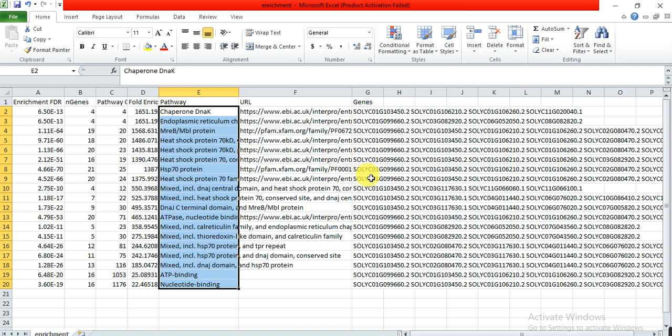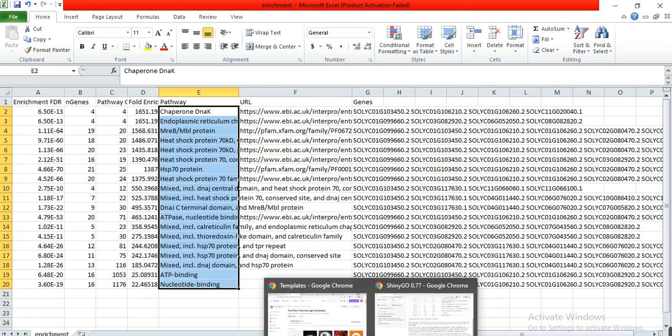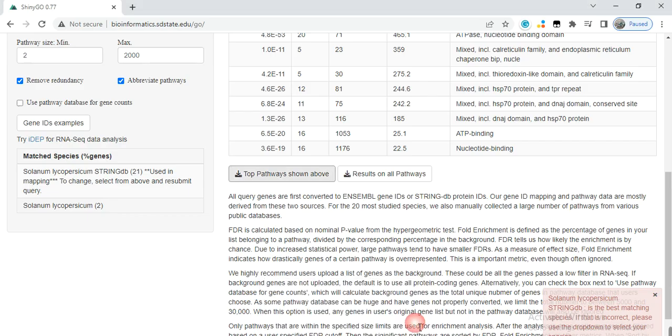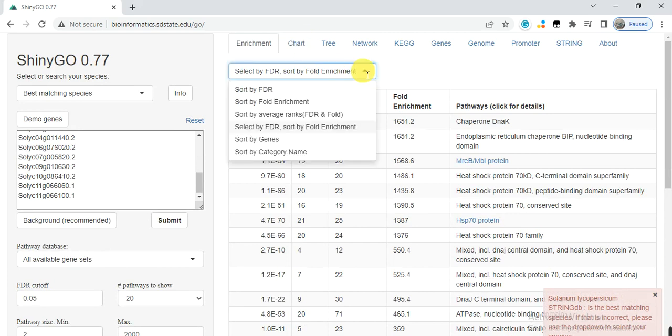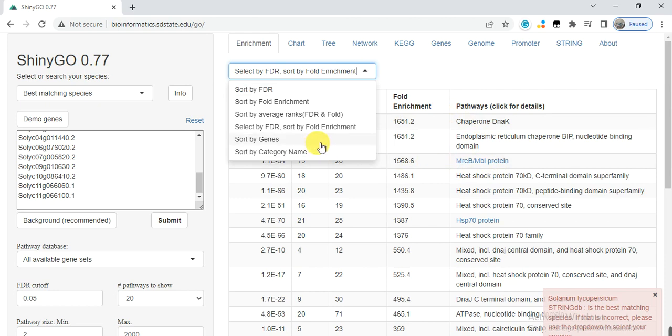Now we move towards that website, and here we can click on chart. Here you can also select other information, like how you want to sort this table.